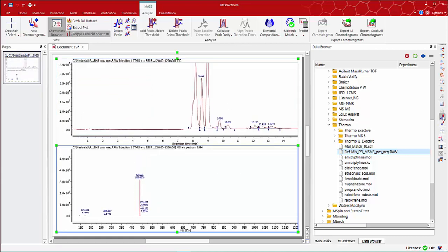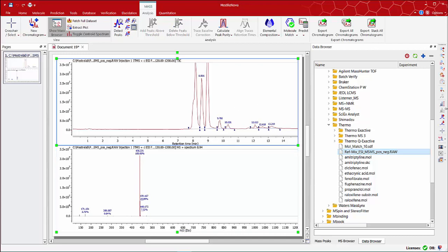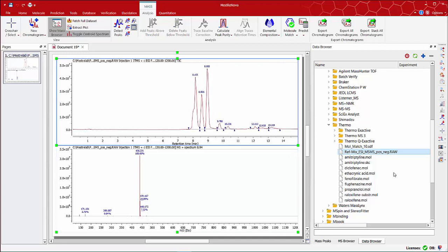You can use the fit to the highest intensity tool to fit the highest peak into the Y dimension. Use the crosshair tool which is equivalent to the icon displayed on the main toolbar at the top.